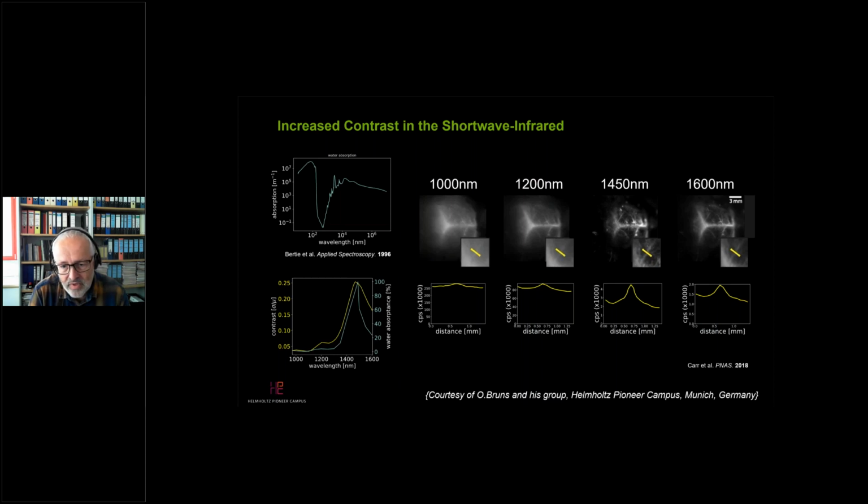On the other hand, the contrast is increasing, because photons that have to overcome a larger path due to scattering have a higher probability of being absorbed. Therefore, mostly the light leaving or emitting directly from the tissue is detected by the camera. So it gives a better contrast, but you have to cope with a lower signal.